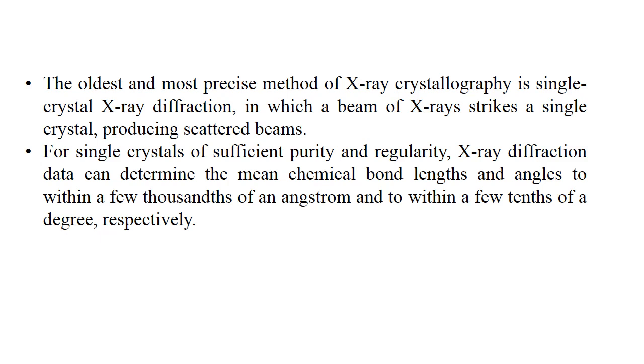It means in the past, different methods of X-ray crystallography were used, and from that the single crystal X-ray diffraction is one of them. In the X-ray diffraction, we use an X-ray beam to study the crystal and atomic structure.